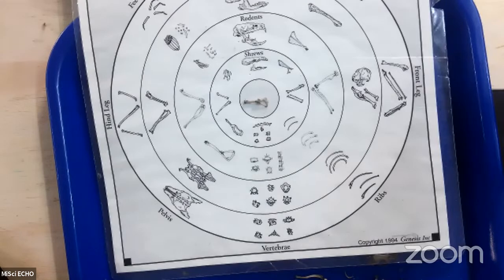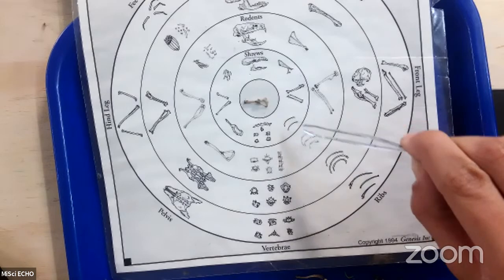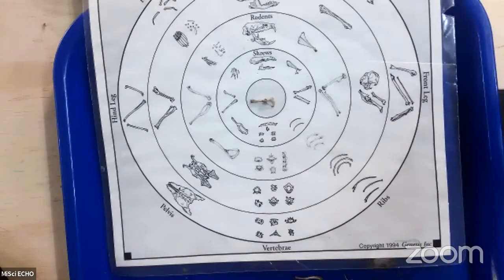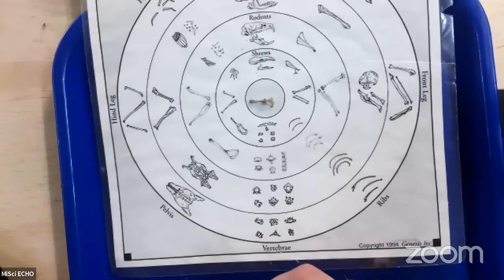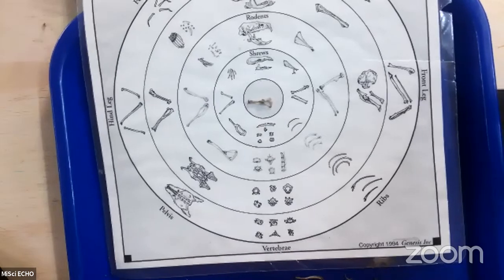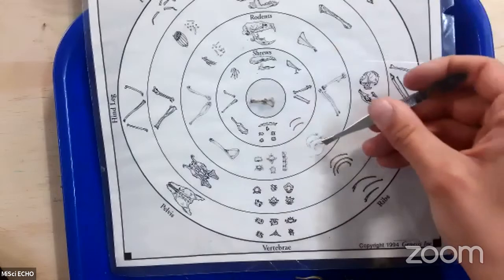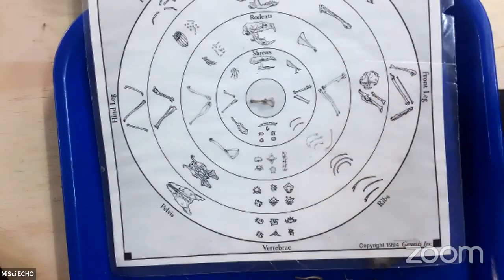A couple of people are guessing a rib. It's pretty small. Our ribs, if you look over here, are very, very tiny. We found lots of ribs from even just the small piece of the owl pellet that we dissected. I can pick one of those up, but you'll notice that ribs don't have that triangular part of the bone. They're very long, curvy, skinny. Oh my goodness, they're so hard to pick up. I can barely grab one. So this would be an example of a rib. Look how small. But they don't have that triangular piece.